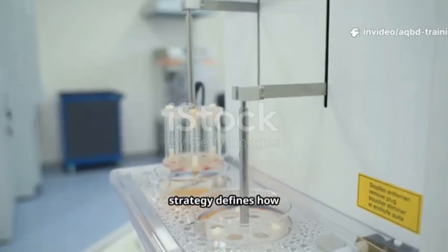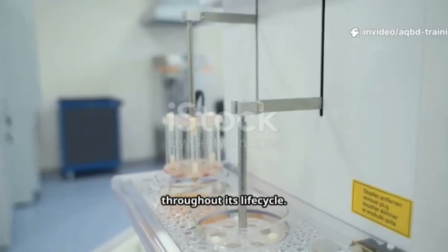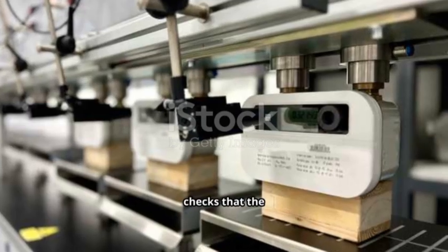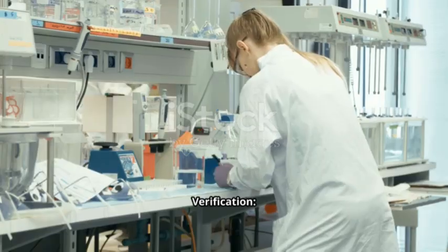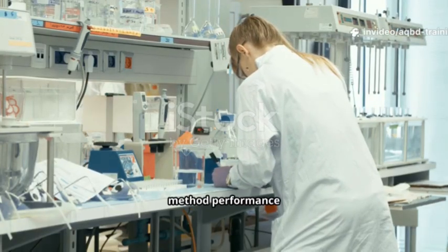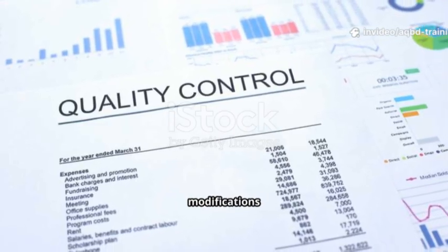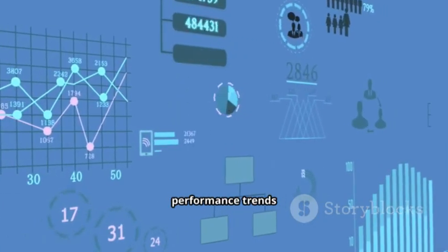The control strategy defines how we'll ensure the method continues to meet its ATP throughout its life cycle. This includes system suitability tests, real-time checks that the method is performing acceptably; periodic verification, scheduled checks of method performance; change control, procedures for managing method modifications; and continuous monitoring, ongoing assessment of method performance trends.